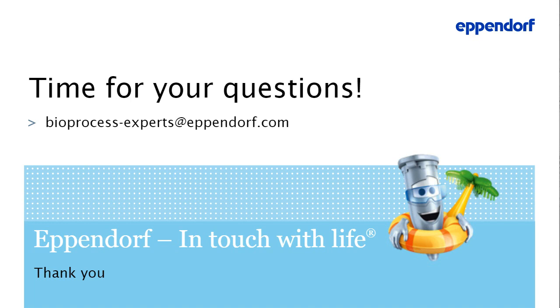The next question is, is there a possibility to measure the kLa in shake flasks as well? Yes, sure. You can also measure the kLa in shake flasks, meaning the maximum aeration capacity of the system for the given set of operating conditions. That can be definitely helpful for optimization of pre-cultures, or also if you have any issues with process transfers between shakers and bioreactors. As you know, shaking and stirring is often the difference, so you may encounter problems, and keeping the kLa constant is one good strategy.